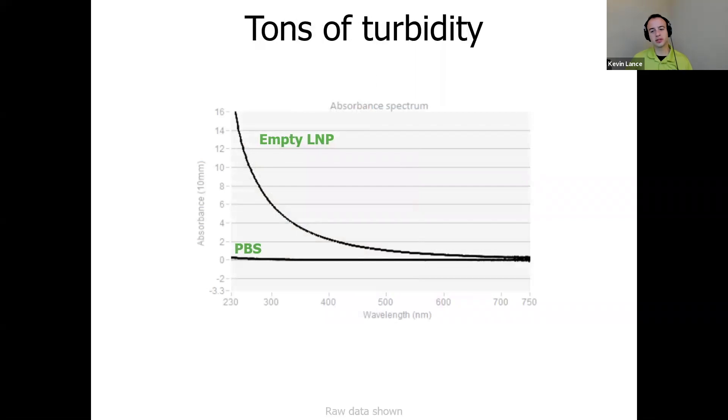So here's a quantitative look at all that turbidity shown by comparing the signal from a PBS buffer against the signal from an empty LNP. That's the one not loaded with the nucleic acid. These LNPs create a whole lot of scatter signal that looks like absorbance but usually just gets in the way of doing the analysis you want to do.